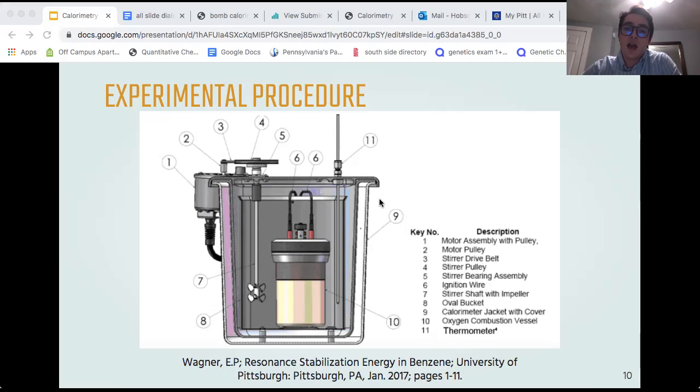Once this is done, we're going to add about 1 milliliter of water to the bottom of the oxygen bomb outer case. Then we place the fuse inside while being extremely careful to make sure that the lid, once we're done, is completely tightened, because if not, it will not explode. We then closed the pressure release valve and vented the bomb twice. Once that was complete, we pressurized it again with oxygen to about 30 ATM, then placed the bomb inside a calorimetry bucket.